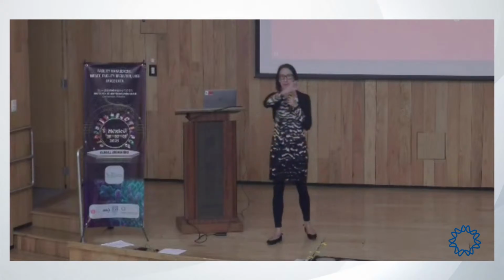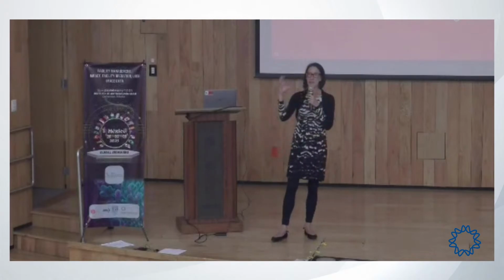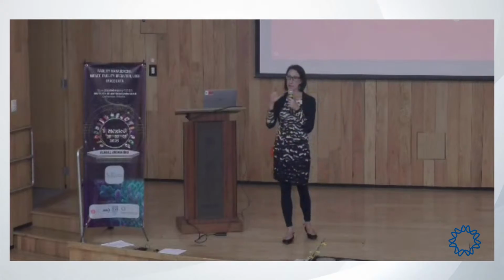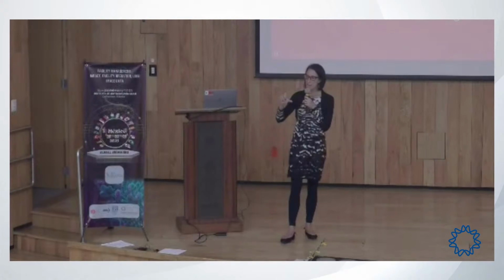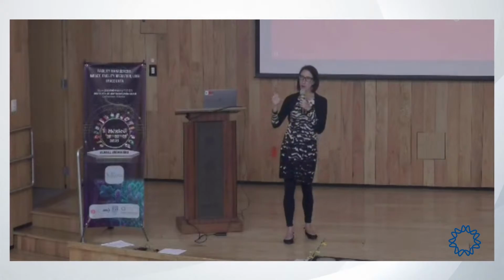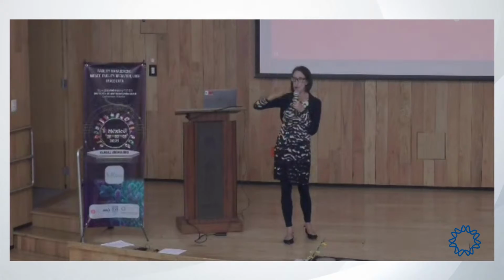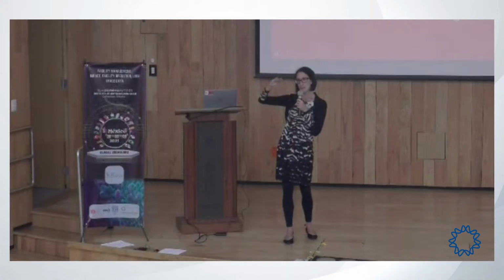Yeah, so the resolution I showed is what we call the overall resolution, but usually when you are publishing a figure in a paper in cryo-EM, you have the local resolutions. For example, in the core of the protein, which is very stable, the resolution can be probably 3 angstroms, depending on the sample. And some areas that are flexible or disordered can go to 8 angstroms. So the overall resolution can be 5, but you have local resolutions.